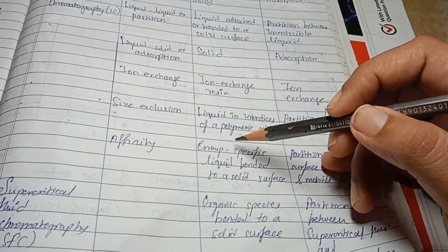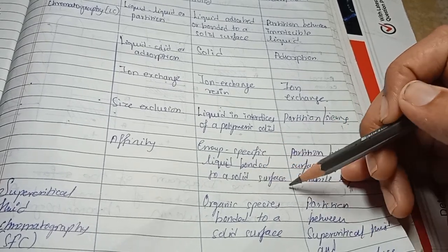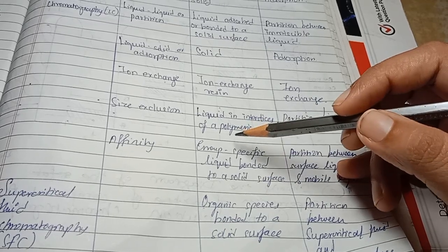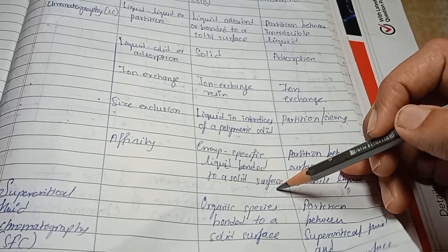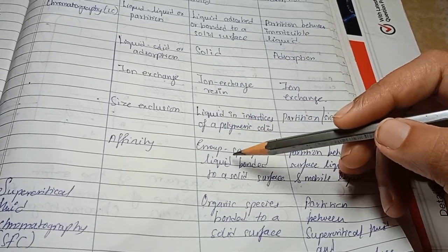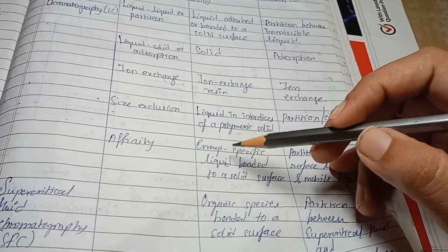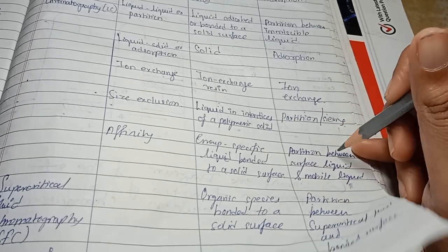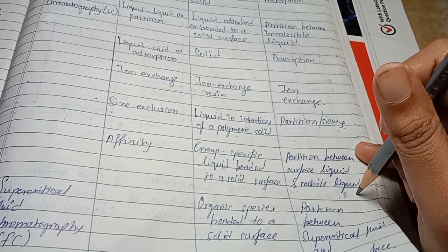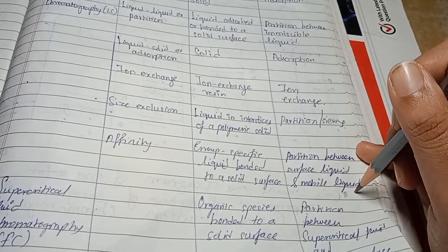Now affinity has a stationary phase which is a group-specific liquid bonded to a solid surface. So this stationary phase is a solid surface which allows only a specific type of liquid to flow through due to a functional group, due to different functional groups. The type of equilibrium is partition between the surface liquid and the mobile phase. So the partition will be between the surface liquid and the mobile liquid.